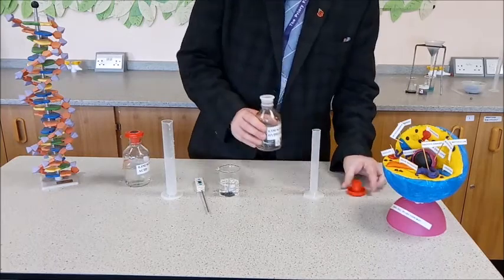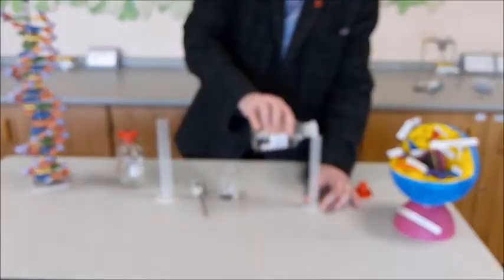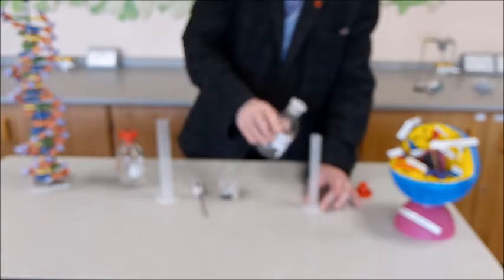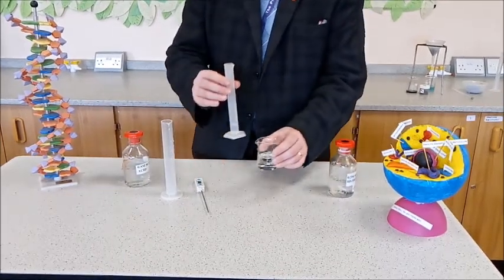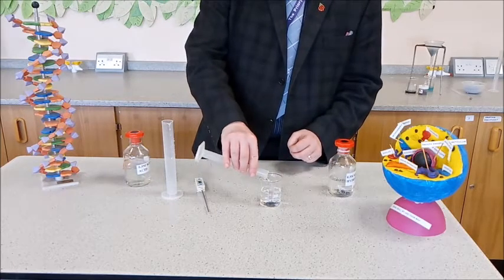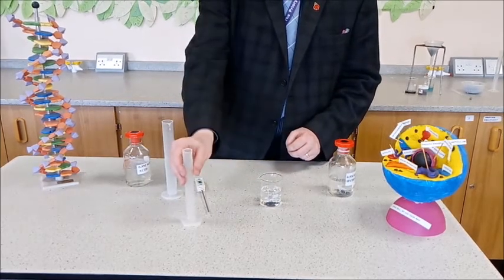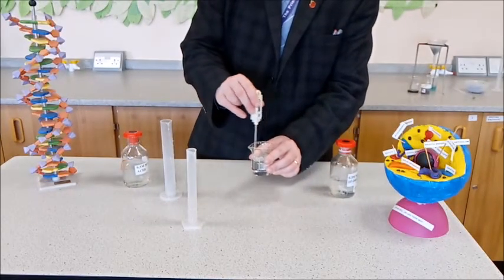Finally, you'd measure out 10 millilitres of sodium hydroxide with another measuring cylinder, pour it in, and stir.